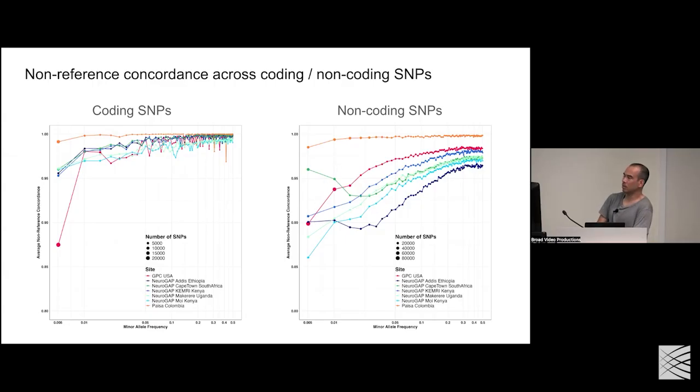So, generally you're going to want to use the exome, but in terms of imputation in coding regions, you've got 30x mean sequencing depth. It is translating into better imputation performance. So you're not throwing out the exome when you run through low pass imputation. You take whatever you can get. And on the other side of things, we do see higher concordance, which I found kind of interesting.